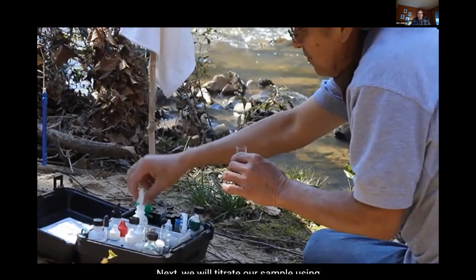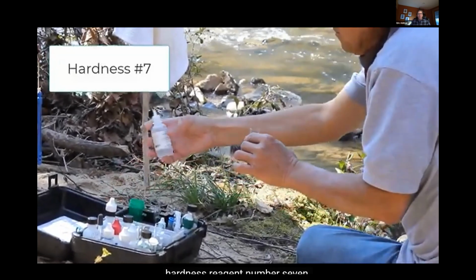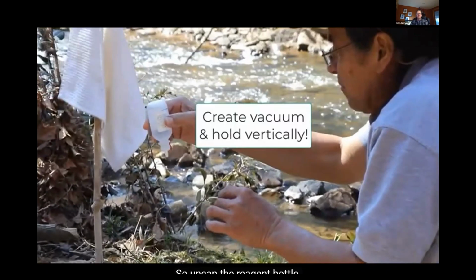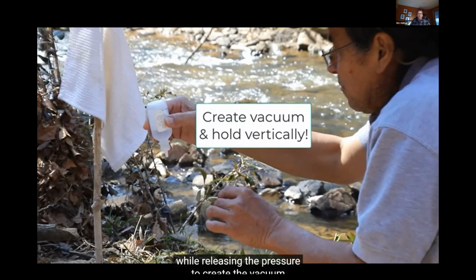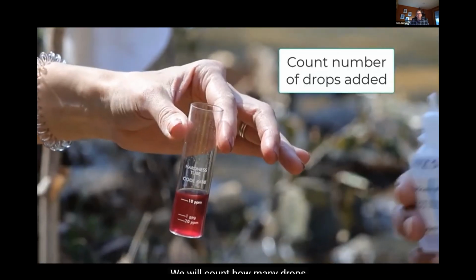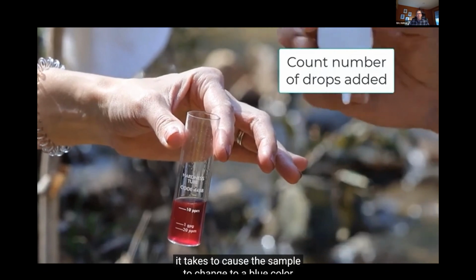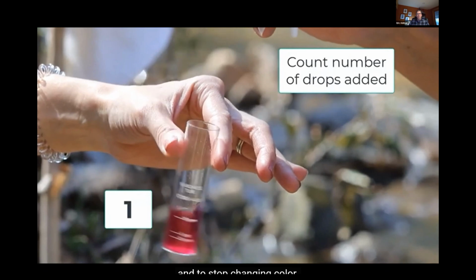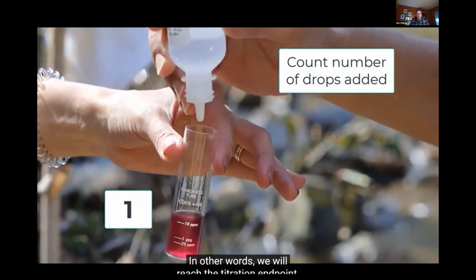Next, we will titrate our sample using hardness reagent number 7. The hardness reagent number 7 bottle also has a built-in dropper, so uncap the reagent bottle, gently squeeze it in the upright position to let some air out, and then turn the bottle upside down while releasing the pressure to create the vacuum to give you more control over the drops. When dispensing the reagent, take care to hold the bottle vertically. We will count how many drops of hardness reagent number 7 it takes to cause the sample to change to a blue color and to stop changing color. In other words, we will reach the titration endpoint.